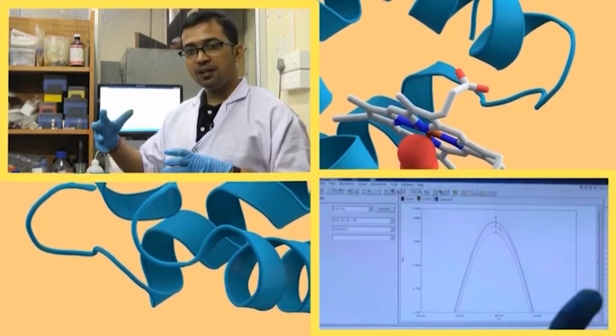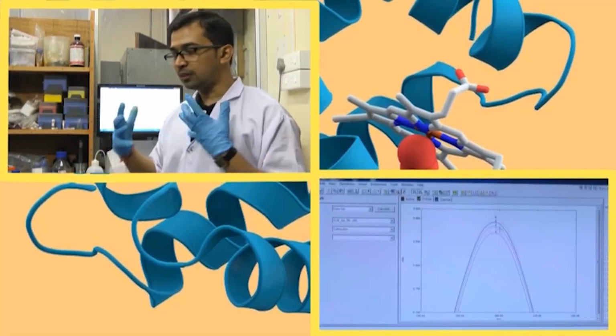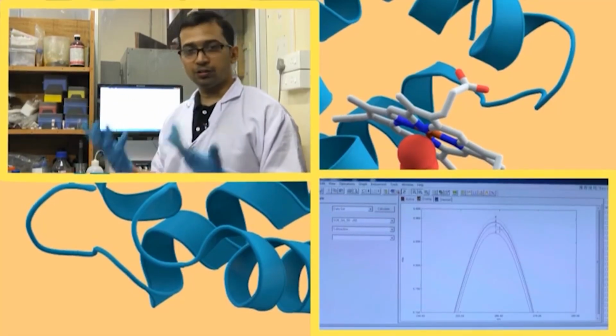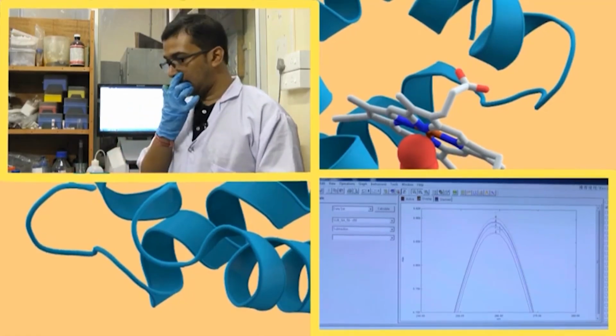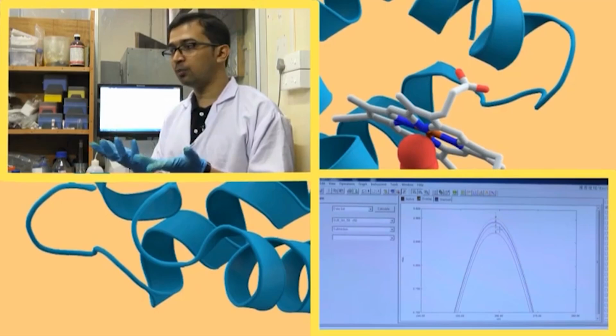Now, it is binding with this protein HSA. What is happening? Gallic acid is not at all exposed. Why this absorbance is decreasing is a very primary question. What happens is that absorbance, why is absorbance shown?